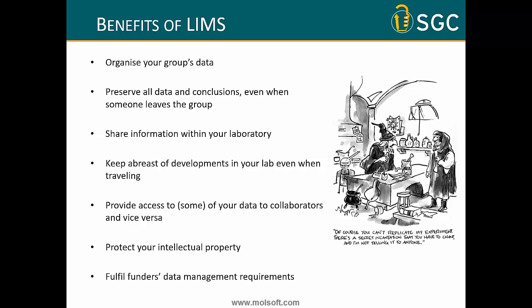These days, even in academia, intellectual property is a big deal, and being able to capture the information in a way that is suitable to be able to generate and justify any intellectual property that may come of it is critically important. And those of us in academia are painfully aware of the needs of funders these days, stipulating that we must have good data management capabilities to be able to deal with this. But as the cartoon on the right sort of tends to suggest, the key thing is you want to be able to capture what you did so that you can reproduce it, even if the person who did it is no longer there, so that what you do is reproducible. That's really critical.